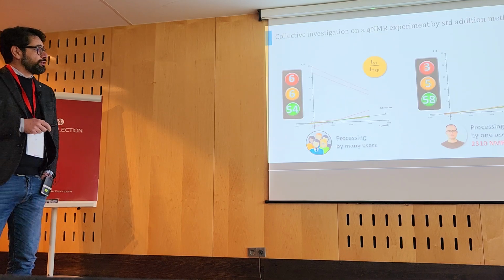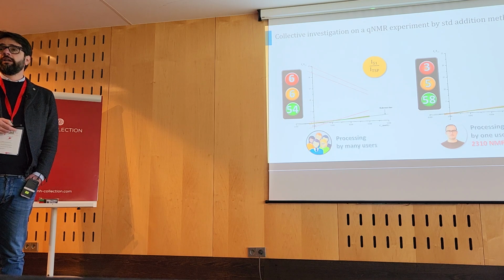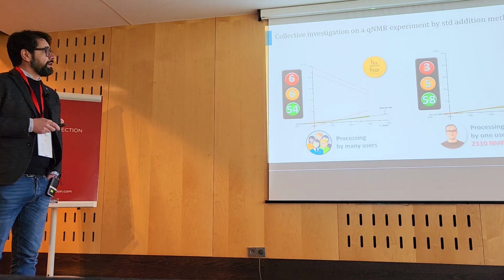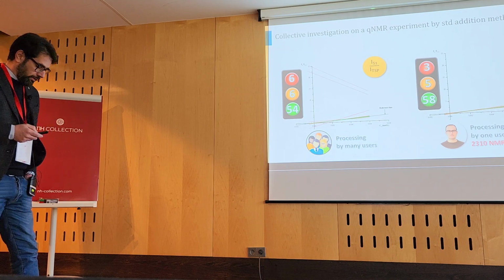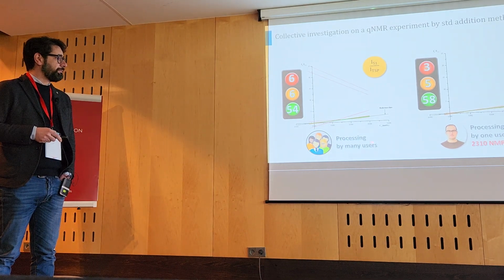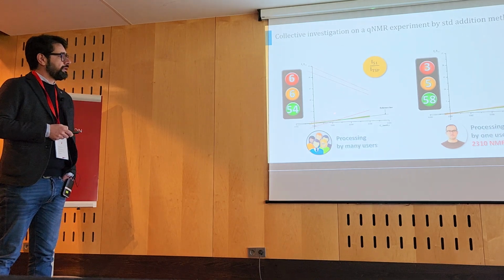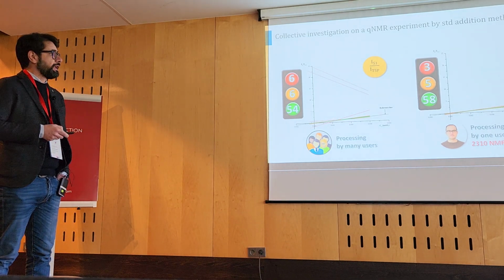And now I will show you a part of the quantification. We developed calibration lines for these metabolites I just mentioned. And the important information I want to give you on this occasion is that when data are processed by many users, one per spectrometer, we collected calibration lines that have these distributions.